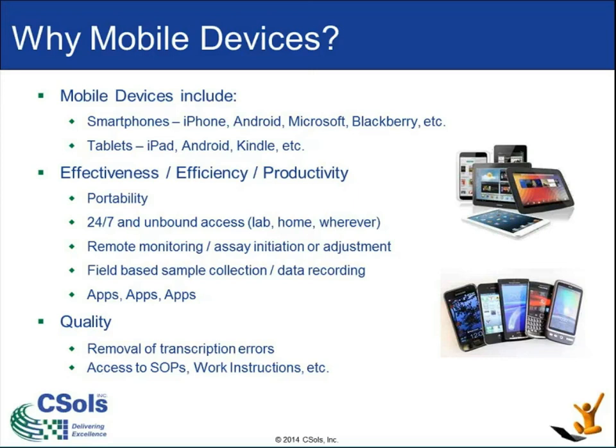For people doing traditional field work, having mobile devices is extremely efficient and also highly beneficial for quality as well. You can take sample collection, you can have information available to you, you can have access to all the various information systems that you need, and for recording data and looking up protocols and the like. And then of course there's my favorite, which is apps. There's all kinds of apps out there, and we'll go through those again.